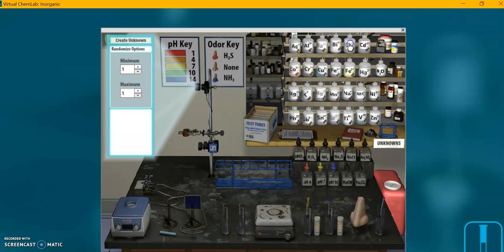Where's the calcium? There we go. You can see that the ones I clicked on are grayed out, showing that we have indeed put them into the unknown.